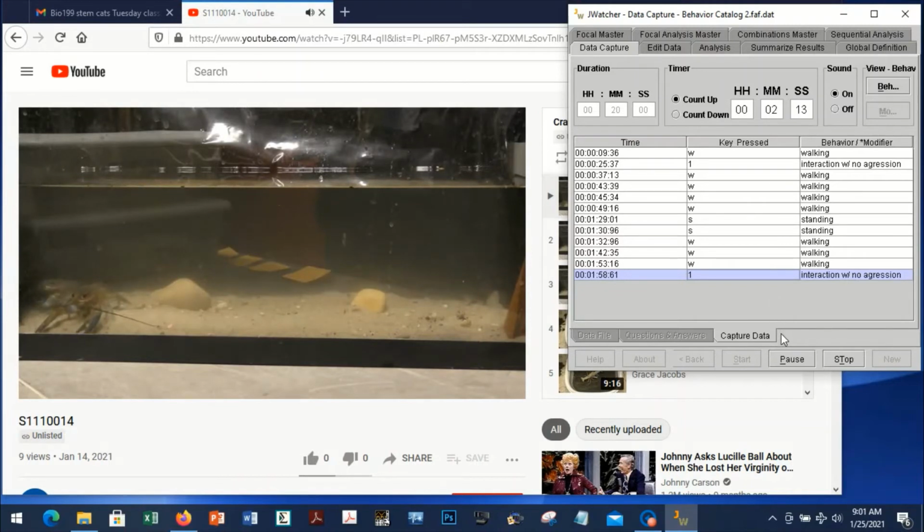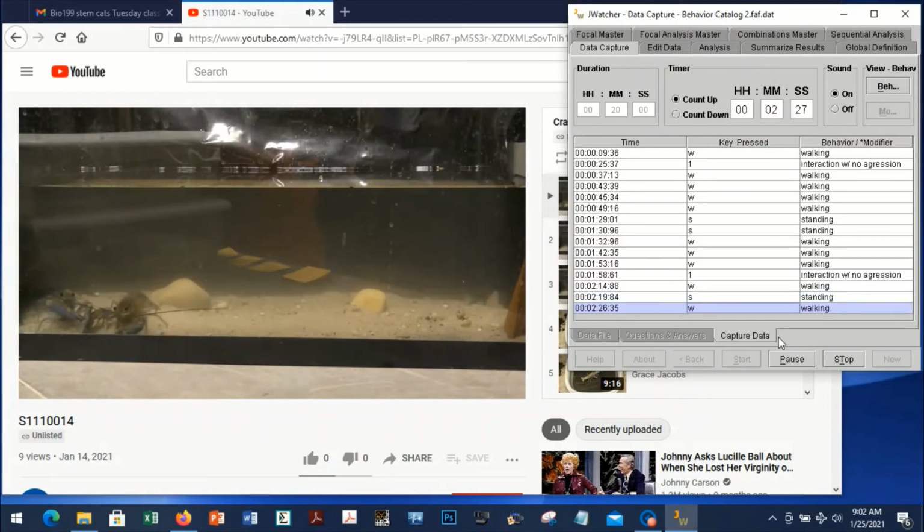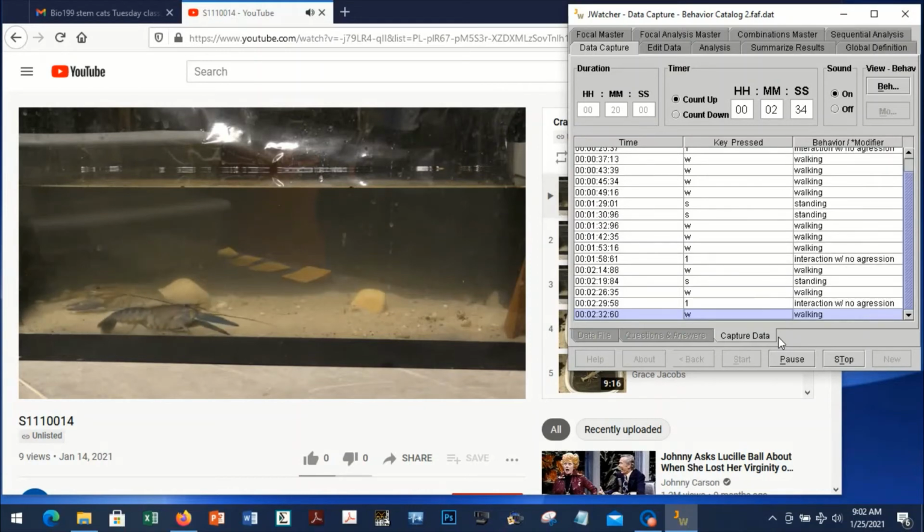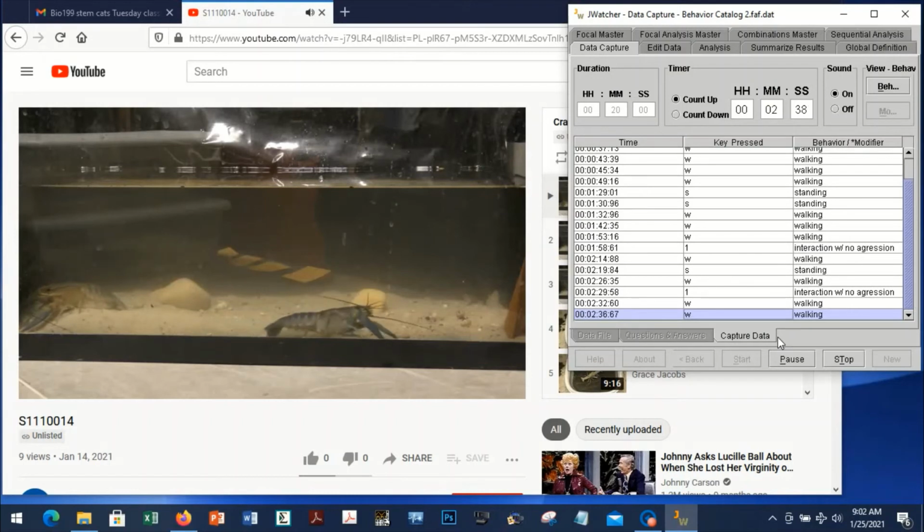It's the one in the back we're watching now, walking, standing still, just kind of standing still, walking. There goes a touch, no threat, walking, just still walking, standing still.